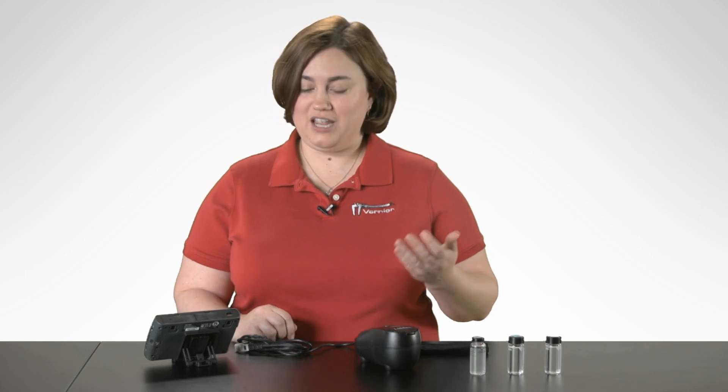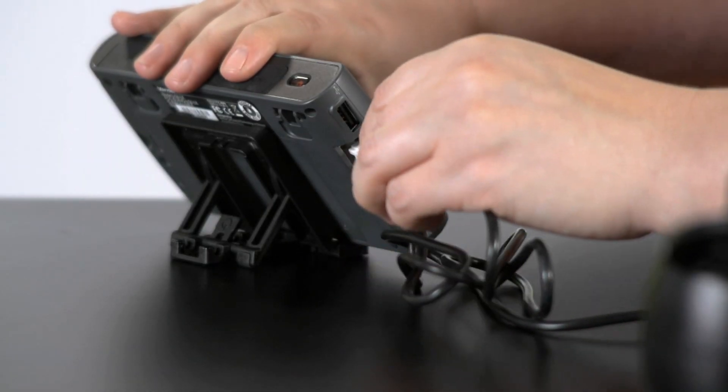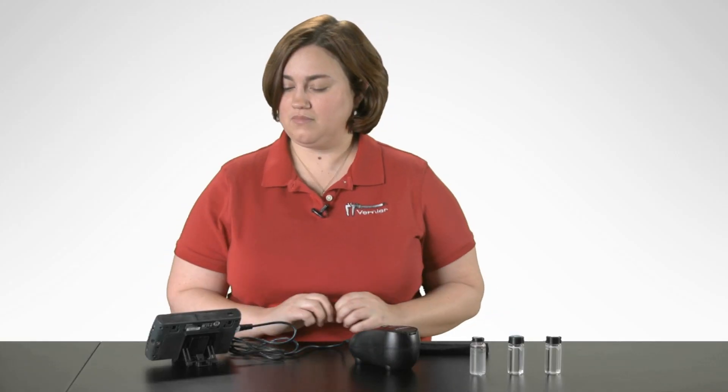First, what we have to do with our turbidity sensor is connect it to our LabQuest 2. Once the turbidity sensor is connected, if you have a very clear sample of water that you're measuring, you're going to want to let it warm up for about five minutes. If your sample of water is more turbid or a lot cloudier, you will not need to let it warm up for that long.